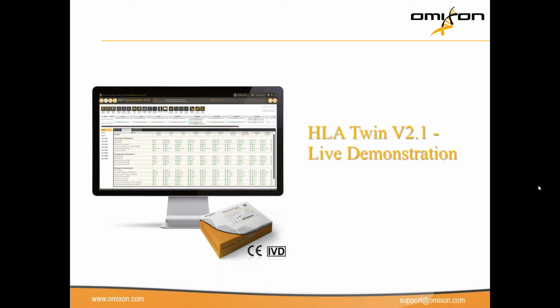Yeah, maybe that wasn't really clear, but the microflow cell is with 300 cycles chemistry, and the full flow cell was used with 500 cycles chemistry. And we used that from March till November last year, and we started doing testing of automation also November last year, but it wasn't related that we changed to the microflow cell at the same time as we started testing automation.